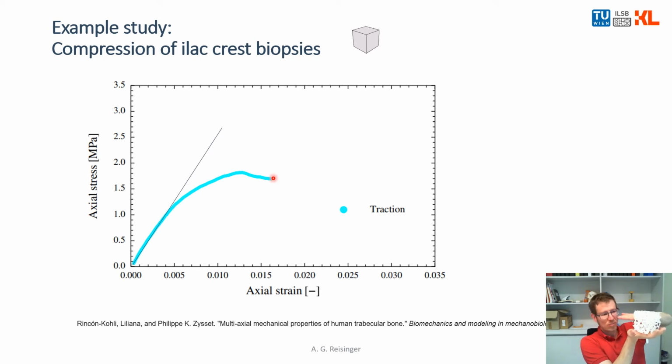You are compressing the remainings of your sample, and you would get, when everything is compressed here, again an increase in stress. And this was avoided here by stopping the experiment. So this was not a drop of stress. The experiment was stopped at this point, to avoid compressing the sample too much and again having a rise of stress.